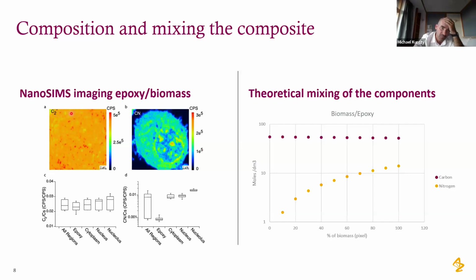And so here we're measuring the carbon signal. And you can see that even though the cell is embedded in there, you don't see a dramatic drop in the carbon signal. So if the drug is located inside this cellular area, and we normalize to it, we should get a value that's comparable to a blank drug, or metabolite, inside of just the pure epoxy.